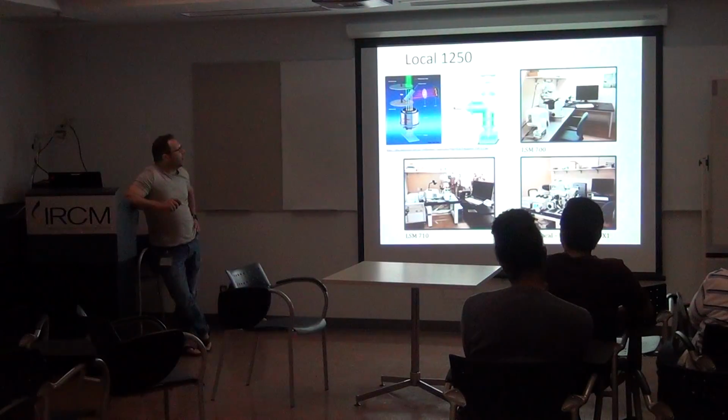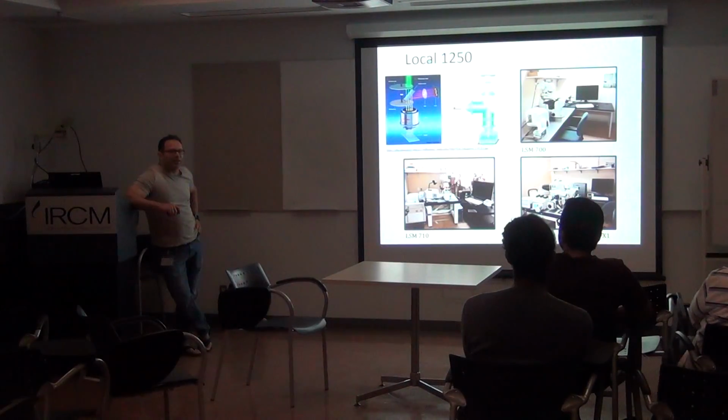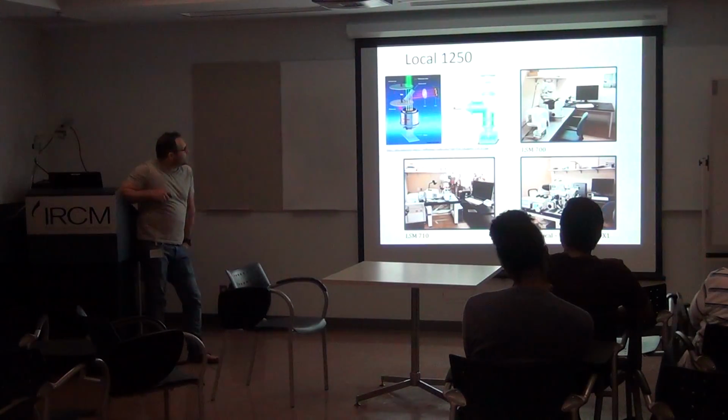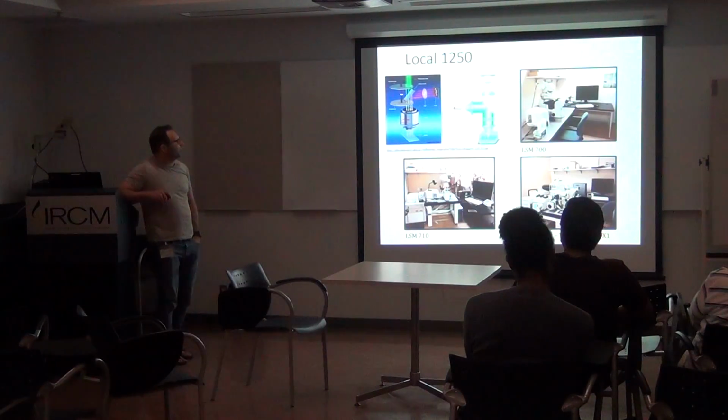Okay, so now I'm just going to show you with pictures what the core facility looks like, and what kind of instruments we have. So again, the spinning disc and confocal. You have that drawing that shows you that only the focus will go through the pinhole here and be detected by the photomultiplier tube.